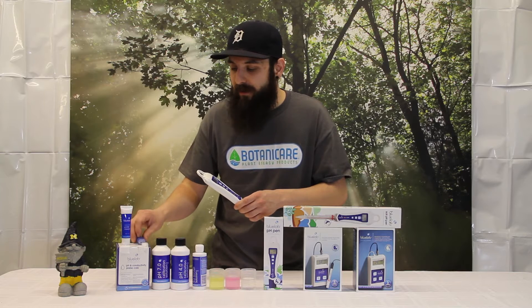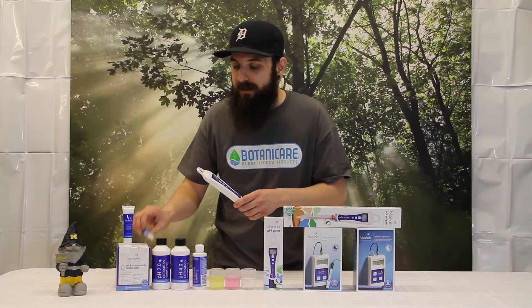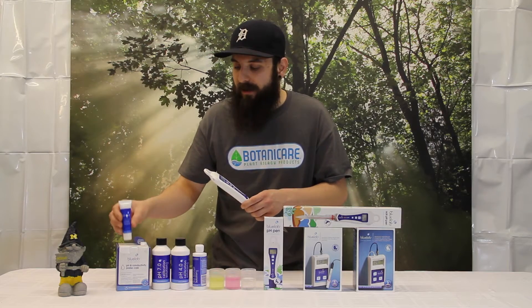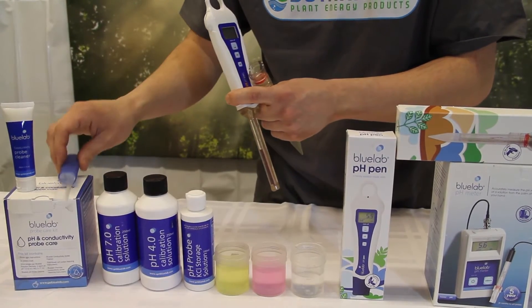If you need to clean your probe, I recommend getting their cleaning system — it's got a soft bristle toothbrush and some actual probe cleaner. If you don't have that around, go ahead and just use a soft bristle toothbrush and some lukewarm water.